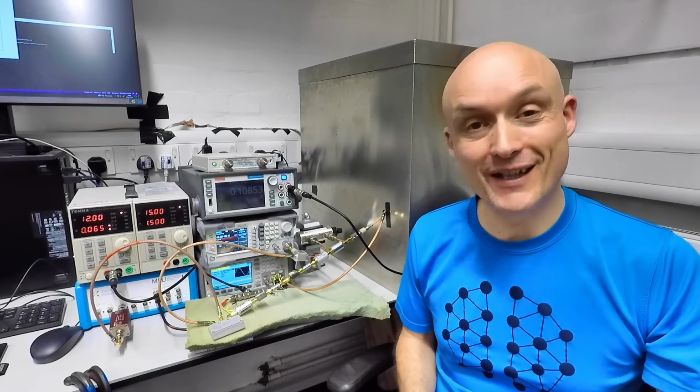Now let's meet Scott, who's going to talk to you about how it was designed in the first place. My role in the project was to design some of the parts in Autodesk Inventor, and most of these were made in the department by 3D printing. I'm going to take you through some of those designs now.